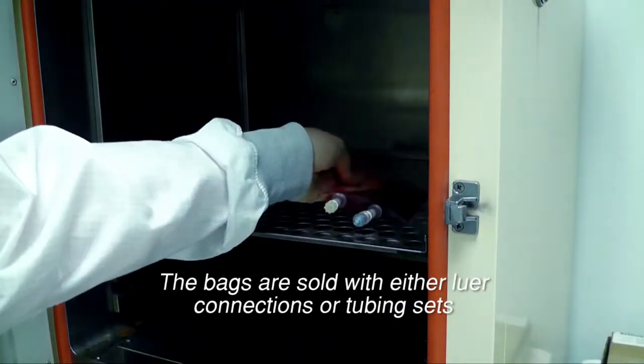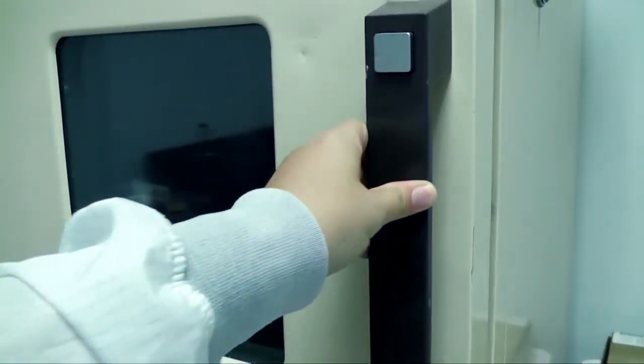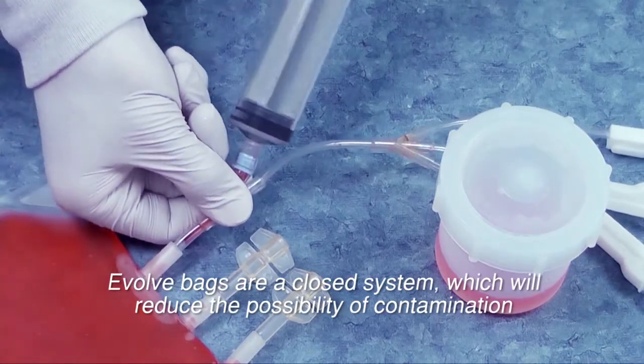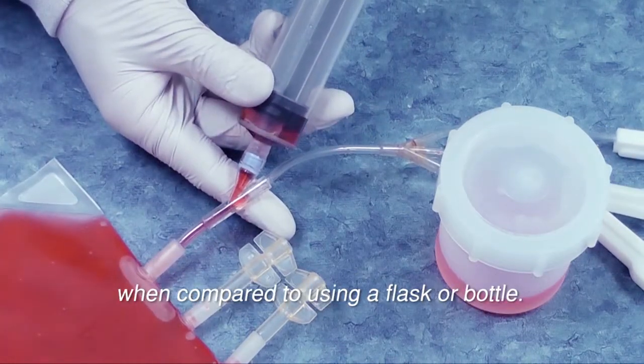The bags are sold with either luer connections or tubing sets that may be connected to solution transfer pumps. Evolve bags are a closed system which will reduce the possibility of contamination when compared to using a flask or a bottle.